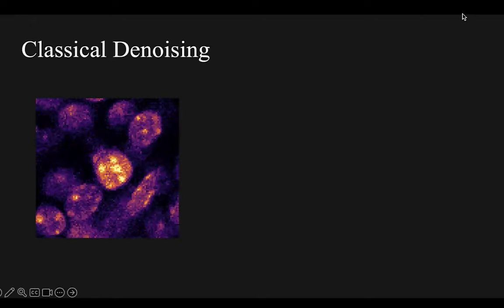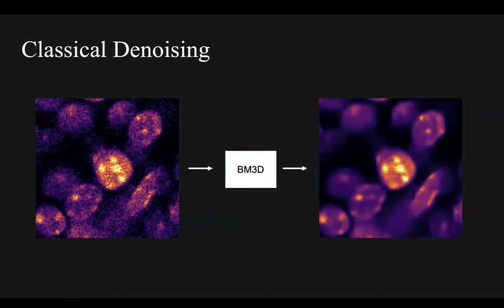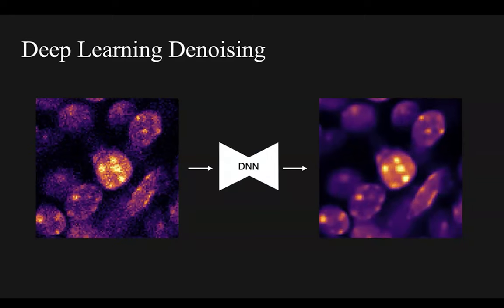Before the advent of deep learning, most classical denoisers such as BM3D had no understanding of the structures they were trying to recover, leading to strange artefacts or blurring in denoised images. Today, deep neural networks (DNNs) can be trained to understand the structures they're trying to recover, and can produce denoised images with no artefacts and with sharp, clear details.